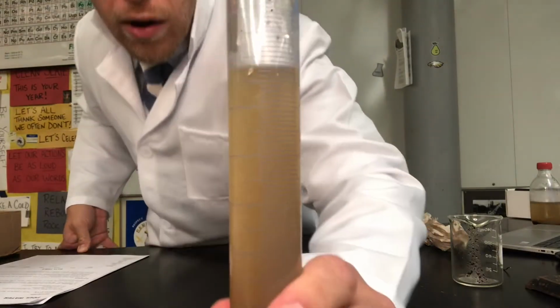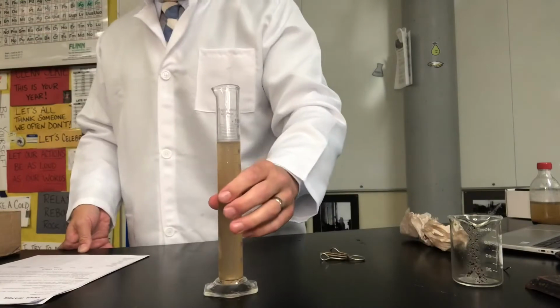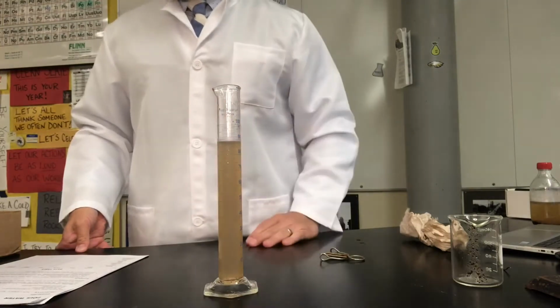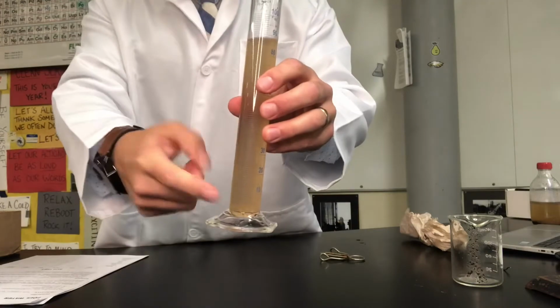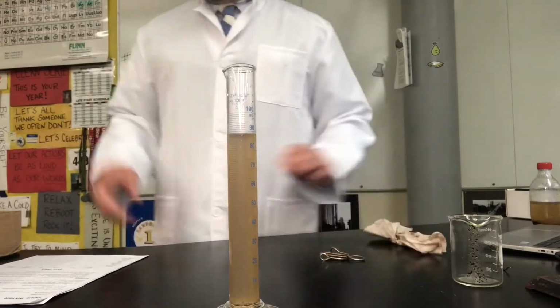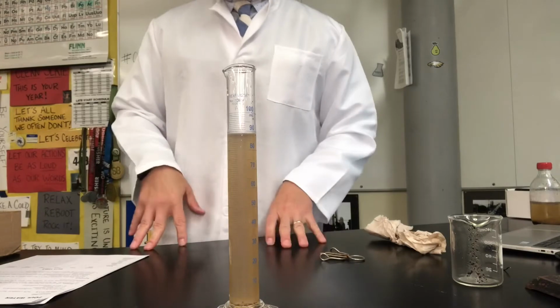As far as the oil, we don't really have that oil layer anymore, which is a good thing. So we got rid of the oil layer. So in presence of oil, you can now put no under your data table. And presence of solid, yeah, there still are some chunks of solid in there. So we're not quite clear of that. But we did remove some of them as well. So that was kind of a nice touch. All right, so now that we're on this part, we've got the data for after oil-water separation.